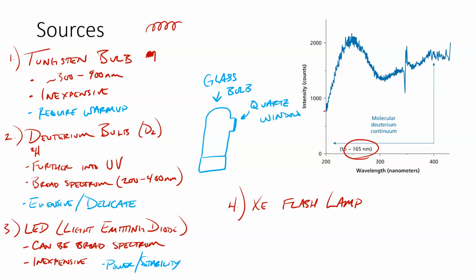Right? And so these are useful for a couple of reasons. The first is, since they're not on continuously, right? They only flash when you're actually taking a spectrum. They have a bit of a longer lifetime because they're not constantly running.